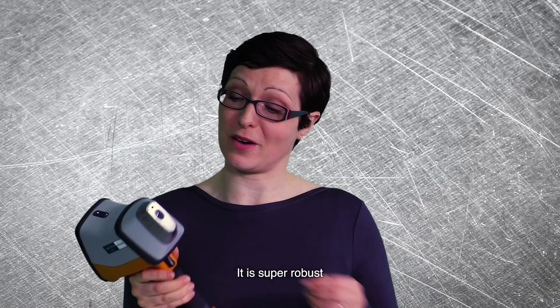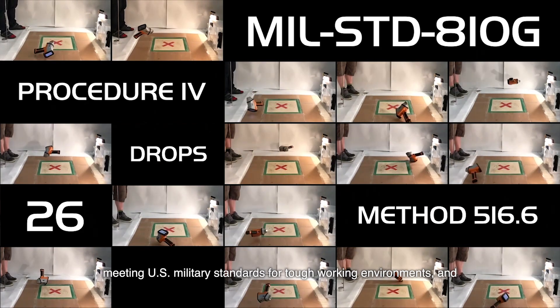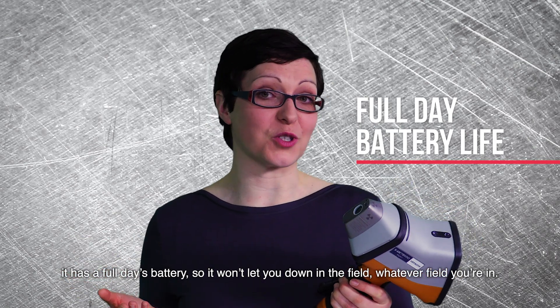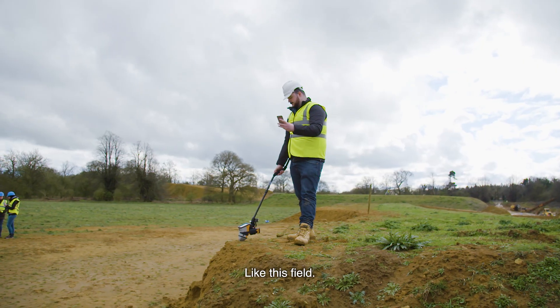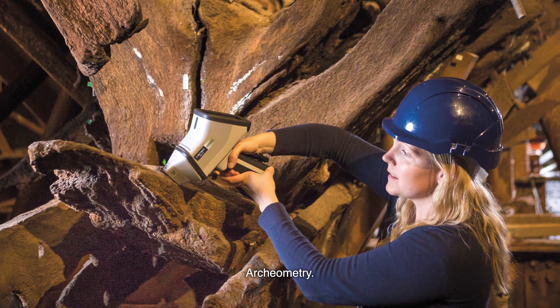It is super robust, meeting US military standards for tough working environments. And it has a full day's battery, so it won't let you down in the field — whatever field you're in. Like this field. Hey, is that the Mary Rose? Archaeometry. Nice field.